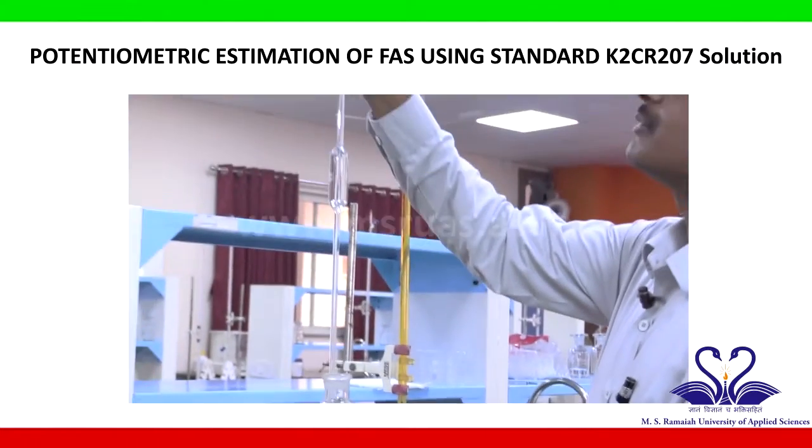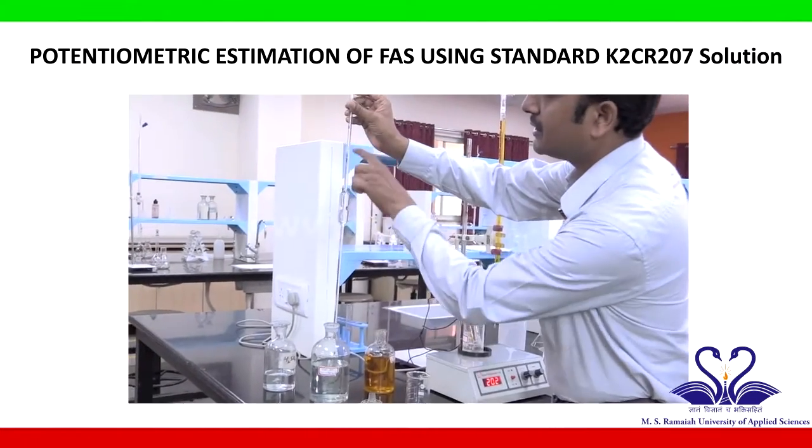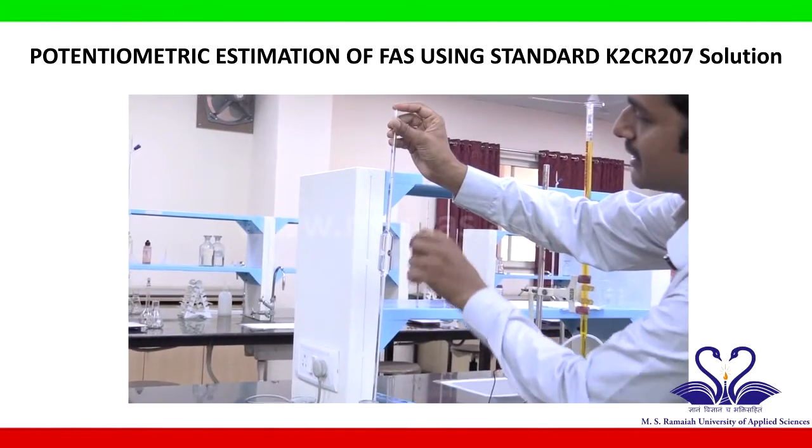Take the solution a little above the mark, and then readjust it to the mark exactly.